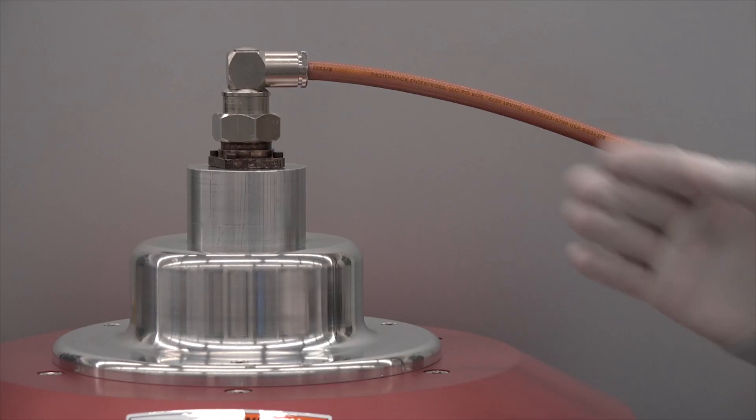The RF, or radio frequency, electrical power also connects here at the top of the chamber. The RF power causes the plasma to form during the deposition process. The deposition chamber is kept under vacuum when not in use. This keeps the inside of the chamber clean.